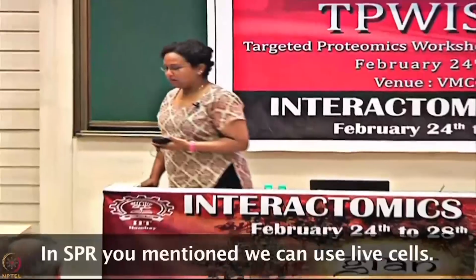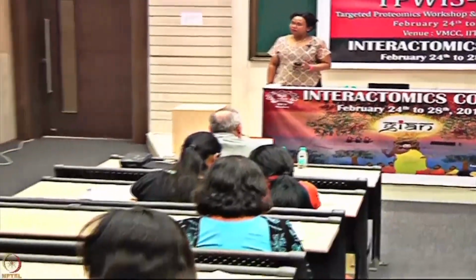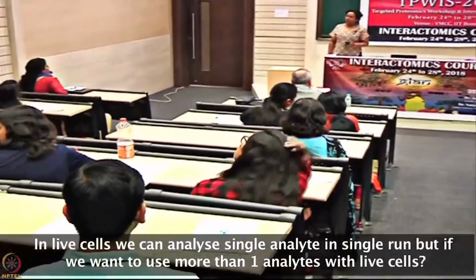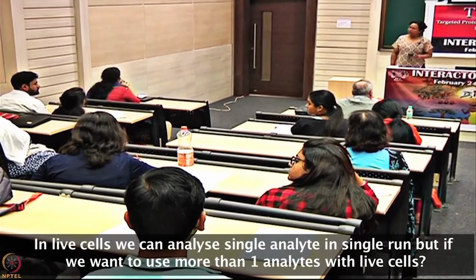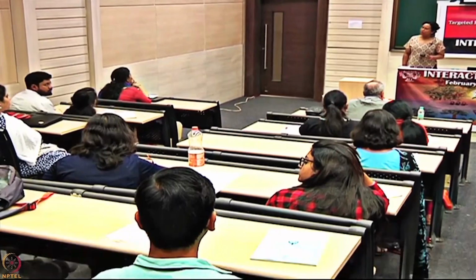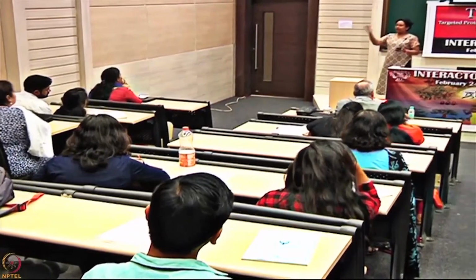Yes, sir. With SPR, we run the assay with live cells, and we have analyzed a single analyte. Can we run more than one analyte with live cells? Yes, you can do it, but in separate runs.